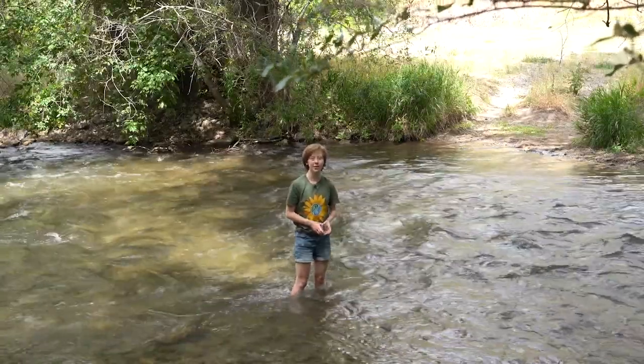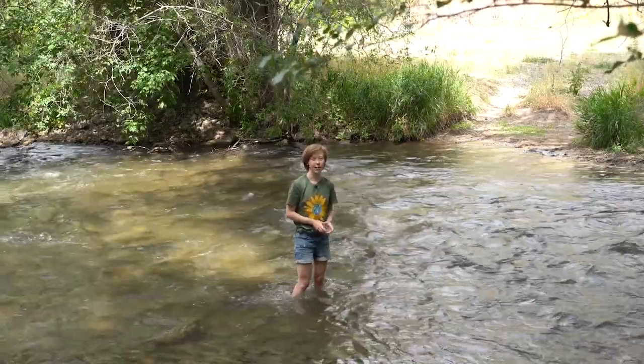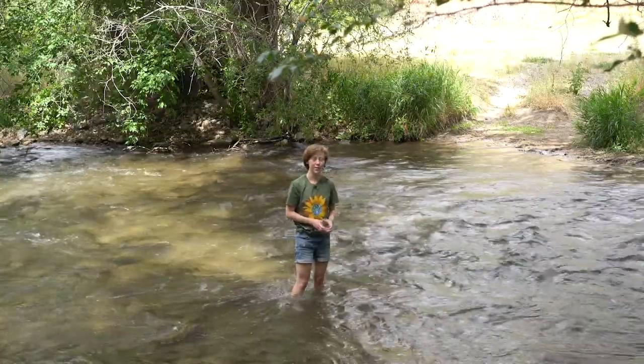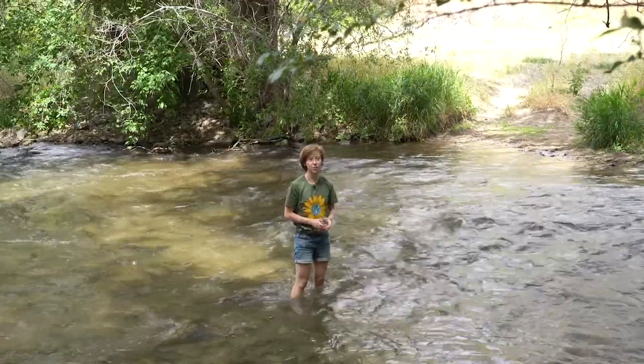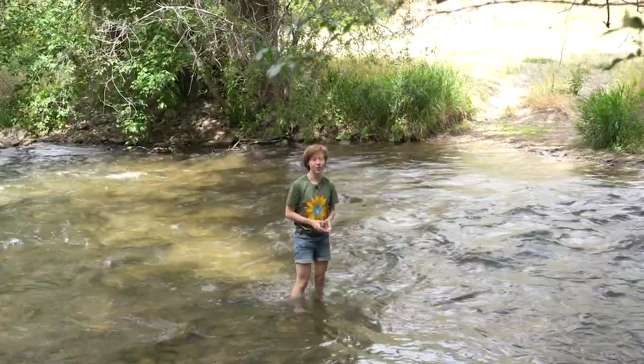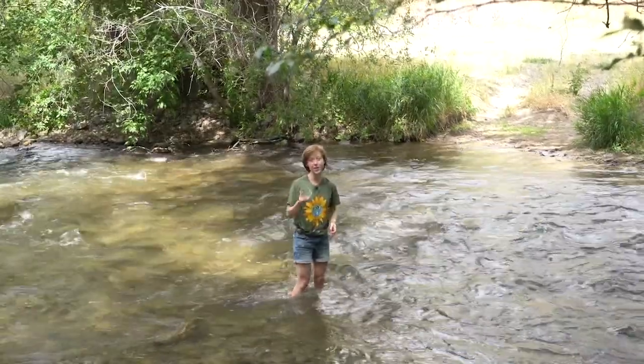When you're ready to collect your salinity sample, you want to find a spot at your site where you can collect a sample that is representative of the entire site or water body. So in a stream, that would be closer to the center. You're going to want to start with your plastic cup and rinse it out 3 times.